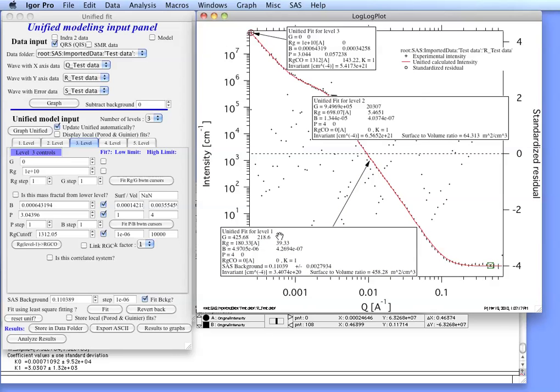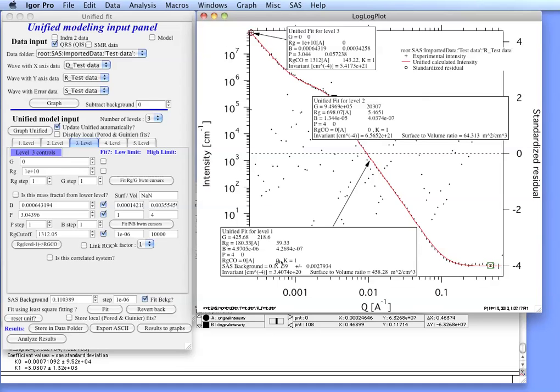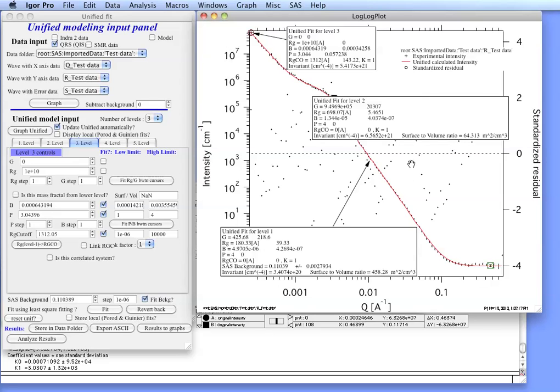So in each one of the tags you can see that there is a description of what it is. You get G and an error, RG and an error, B and an error, and P. If it was not fit then the error is zero. RG cutoff and K. You get a small angle scattering background if applicable and you get a value for invariant which is calculated and surface to volume ratio. The surface to volume ratio is available only if P is equal approximately 4 because otherwise it makes no sense.